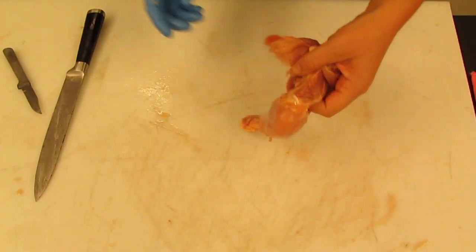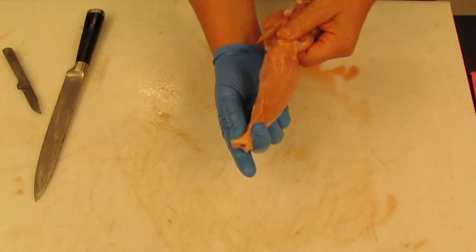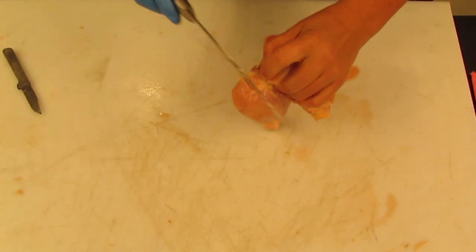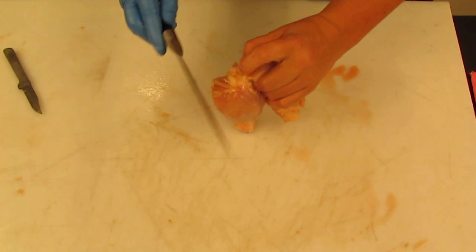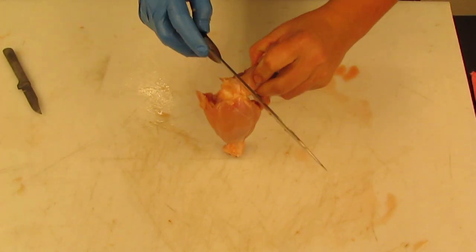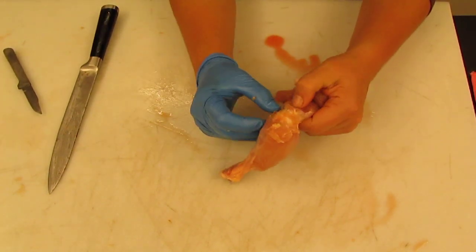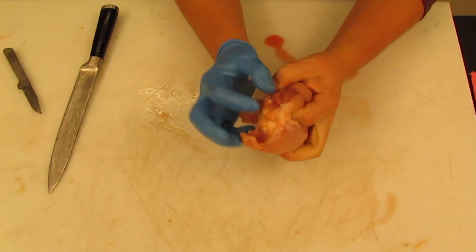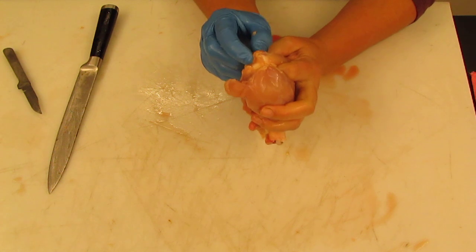All right, so if you're having trouble finding the joint itself, my suggestion would be just to move it and feel for the bones. All right, so right now I am feeling for the patella. I'm cutting away the front of the quote-unquote drumstick. So, slowly getting down to the joint here, what we can see at this point a little bit is this little bump of bone. This here is the patella.